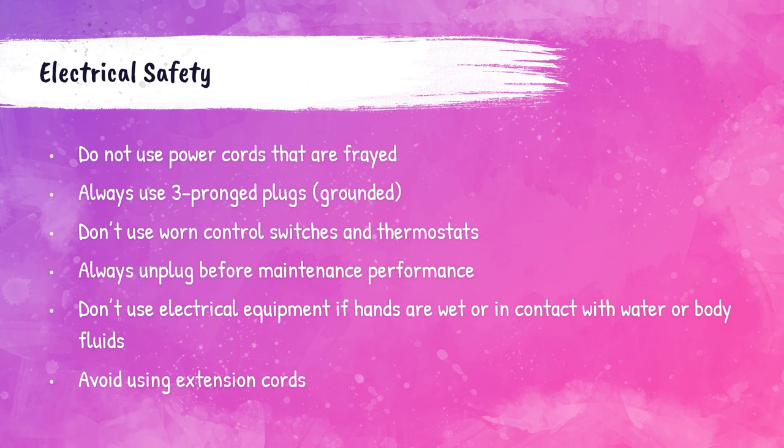Electrical hazards may be present within the laboratory. Power cords that are frayed or aging should not be used. Grounded plugs — those with three prongs — should always be used. Worn control switches or thermostats should not be used, and extension cords should be avoided. Before performing maintenance on any piece of equipment, it should be unplugged. If hands are wet or in contact with water or body fluids, electrical equipment should not be used until hands are dry.